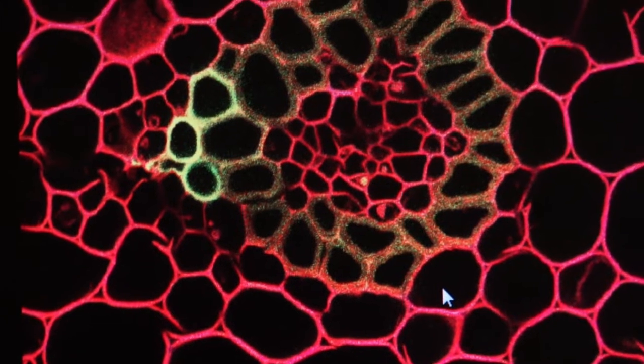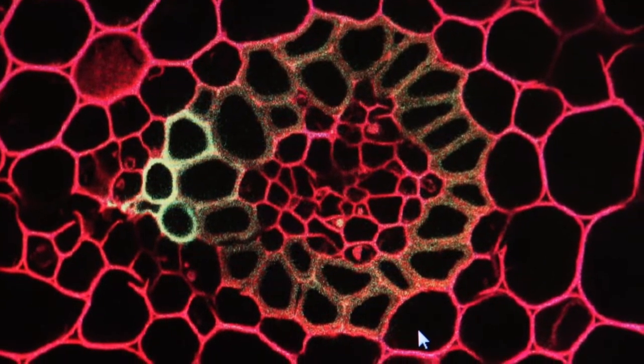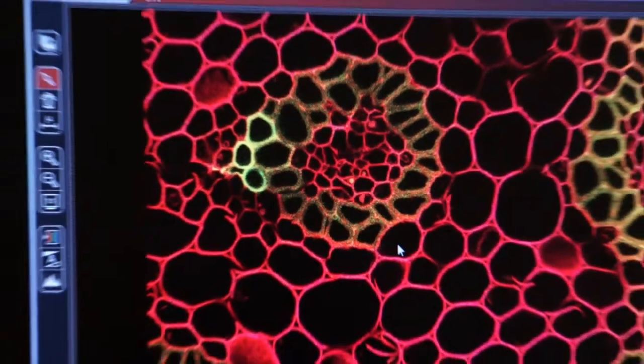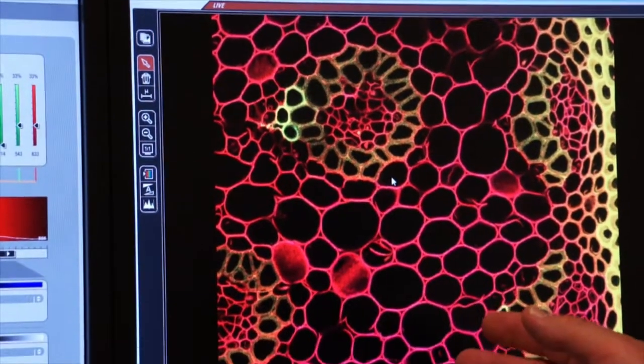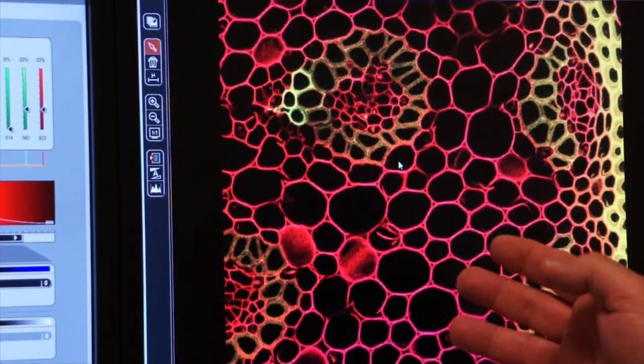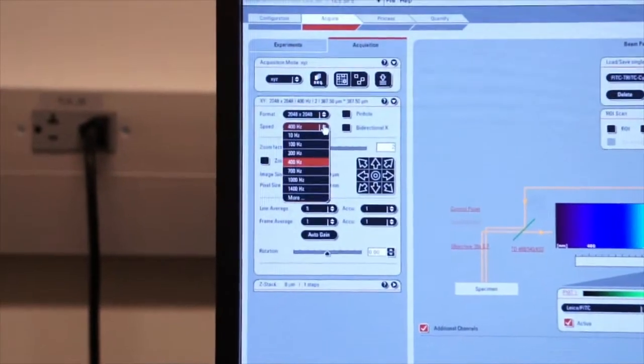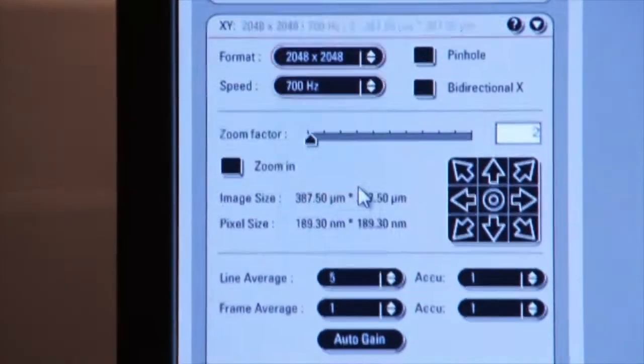So line averaging, frame averaging are very useful. Now remember you see how slow the scan is because we're doing many averages. How do I increase that speed? Well I can go back over to my speed pull down menu and let's say I want to increase it to 700 hertz.